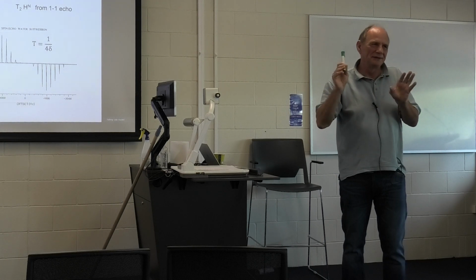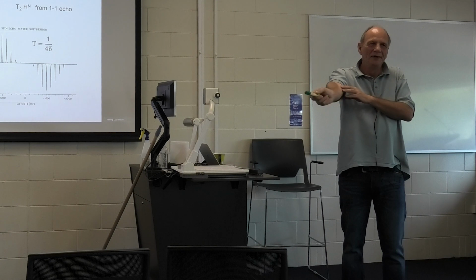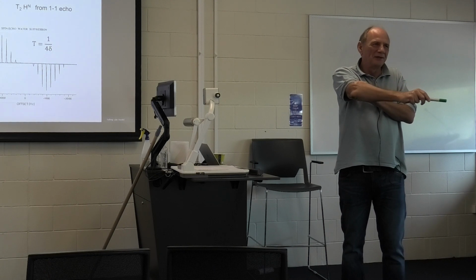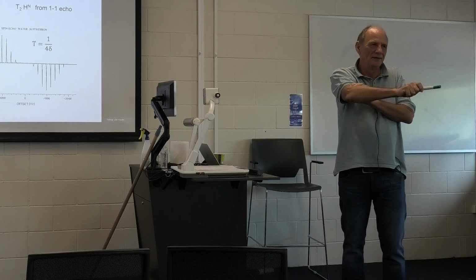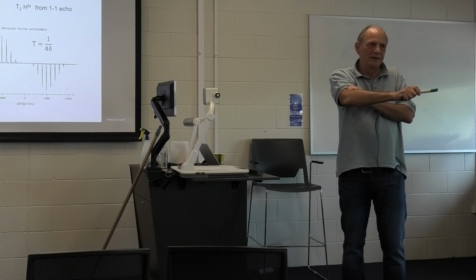I forgot what it is, on the order of 50 microseconds, depending on the spectrometer. Then after these 50 microseconds, I apply the minus X pulse, but I'm in the X direction, so this will not feel it. So this amide proton resonance will stay transverse.